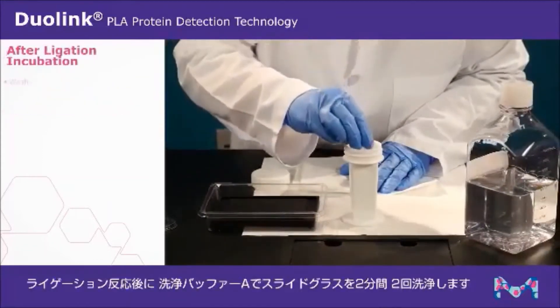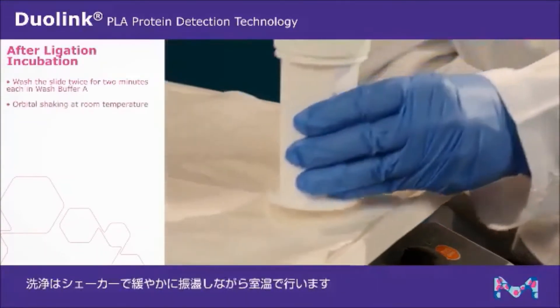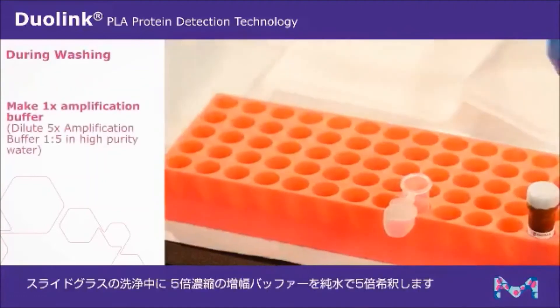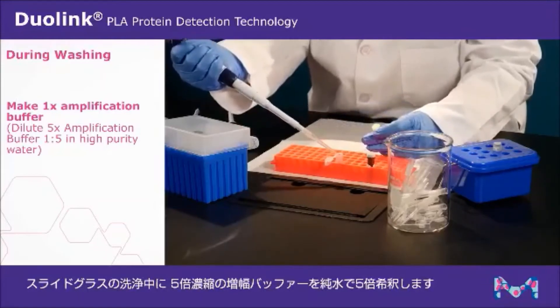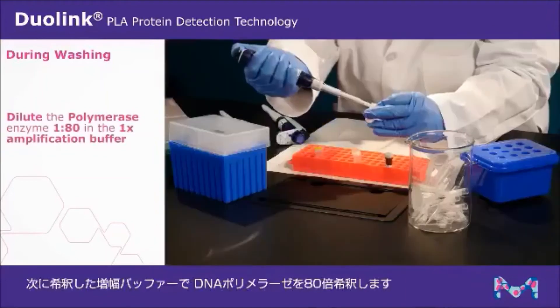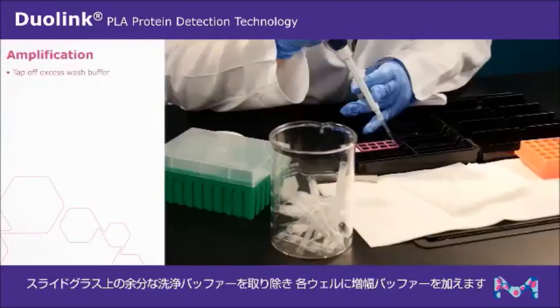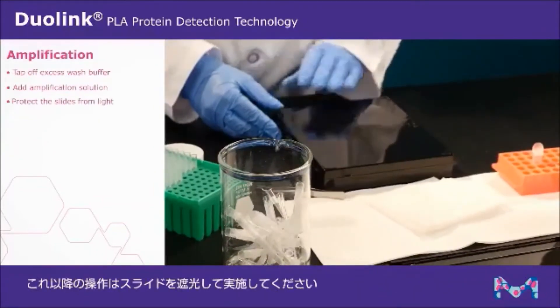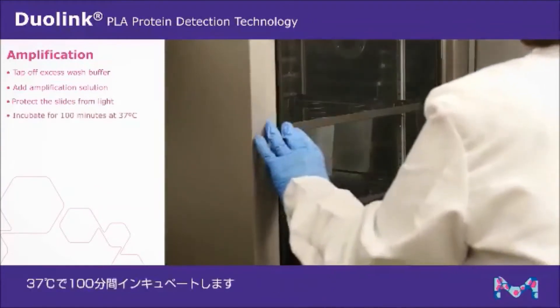Incubate for 30 minutes at 37 degrees Celsius. After ligation incubation, wash twice in wash buffer A for two minutes each with gentle orbital shaking at room temperature. During washing, make 1X amplification buffer by diluting the 5X amplification buffer one to five in high purity water. Dilute the polymerase enzyme one to 80 in the 1X amplification buffer. Tap off excess wash buffer and add the amplification solution to each well. Protect the slides from light from this point forward. Incubate for 100 minutes at 37 degrees Celsius.